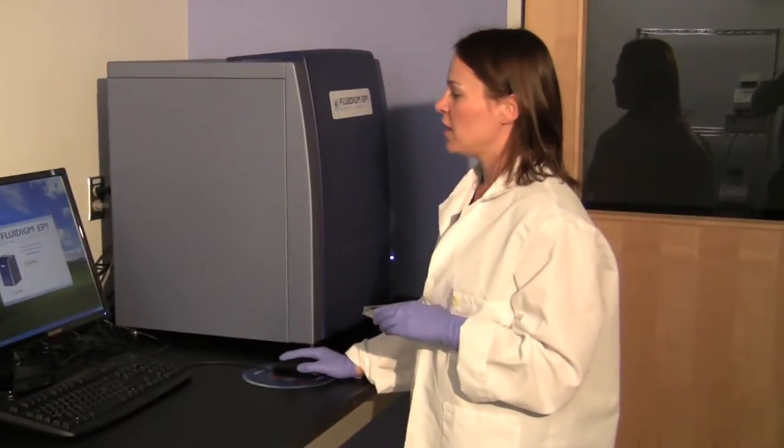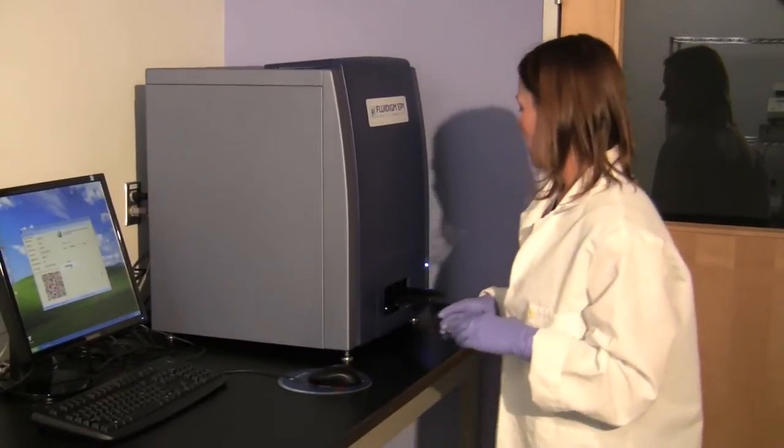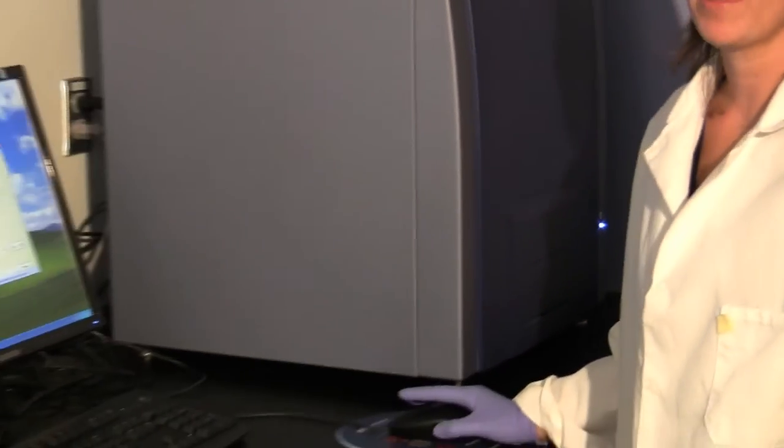So in order to start a run on the EP1, I will just click start a new run. The tray will open. I will place the chip on the tray and choose the load button. The barcode of the chip will be read by the instrument.